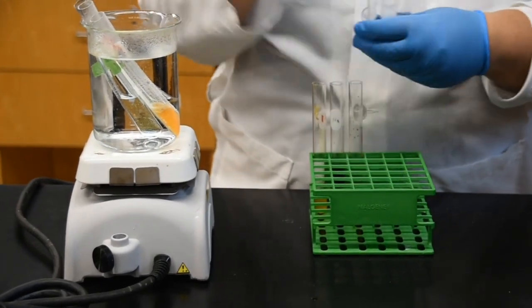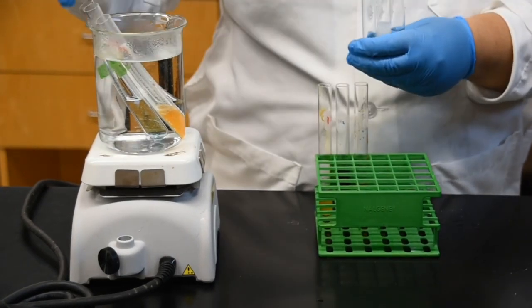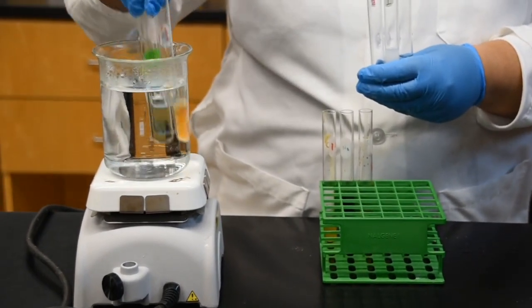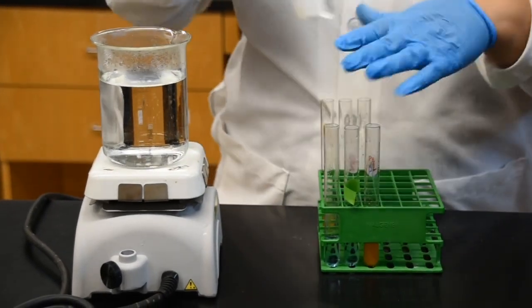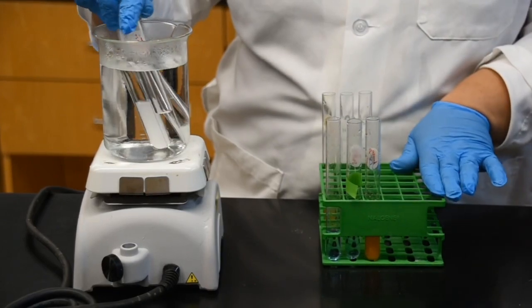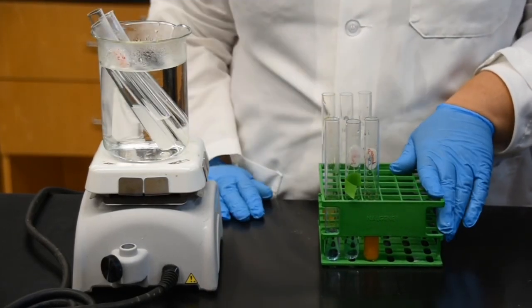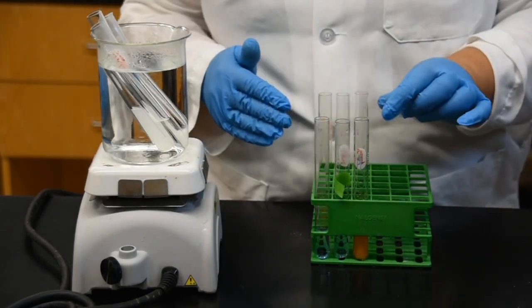So I'm going to take my original samples out for the sugar and put these ones in for them. And don't do what I'm doing, because your tubes might be hot when you're doing this. So I have taken out my simple sugar test, and I'm placing my protein test back into the heat.